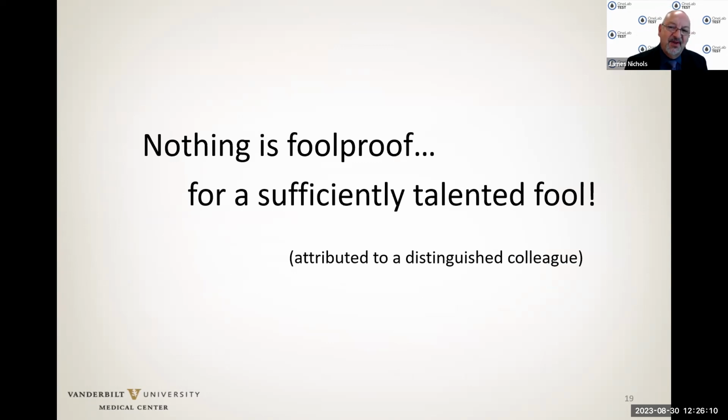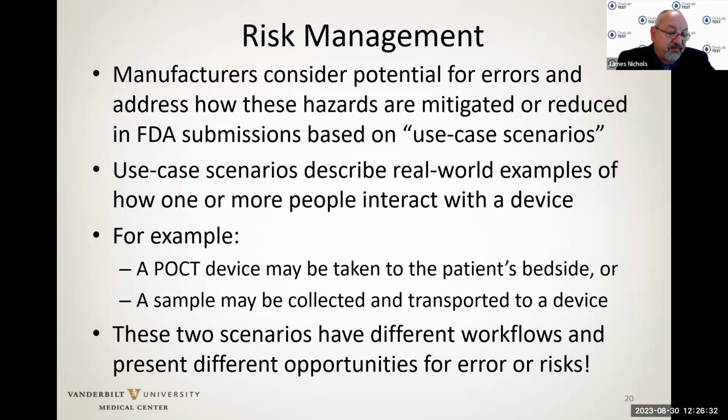I particularly like this. My distinguished colleague said, nothing is foolproof for a sufficiently talented fool. So think outside the box. Think like an operator who is conducting the test, not like a laboratorian necessarily, and think about all the different ways that this device might be used or, as I mentioned, misused. Manufacturers, when they're developing a test and they're going for FDA approval, they consider errors and hazards with that device that could lead to patient harm. And they have mitigation steps, and they show these mitigation steps to the FDA during submission.